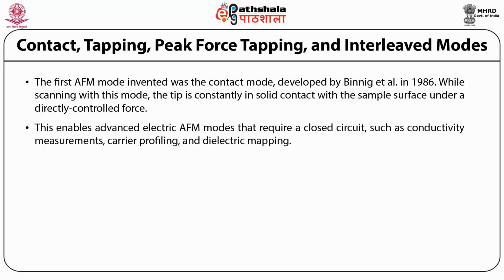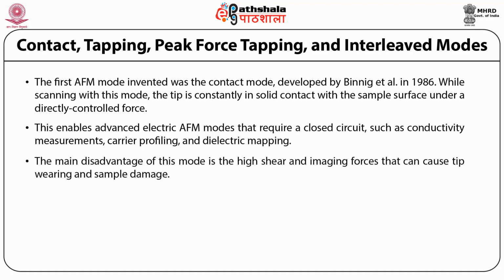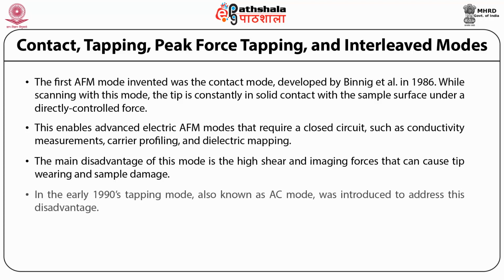This enables advanced electric AFM modes that require a closed circuit, such as conductivity measurements, carrier profiling, and dielectric mapping. The main disadvantage of this mode is the high shear and imaging force that can cause tip wear and sample damage.